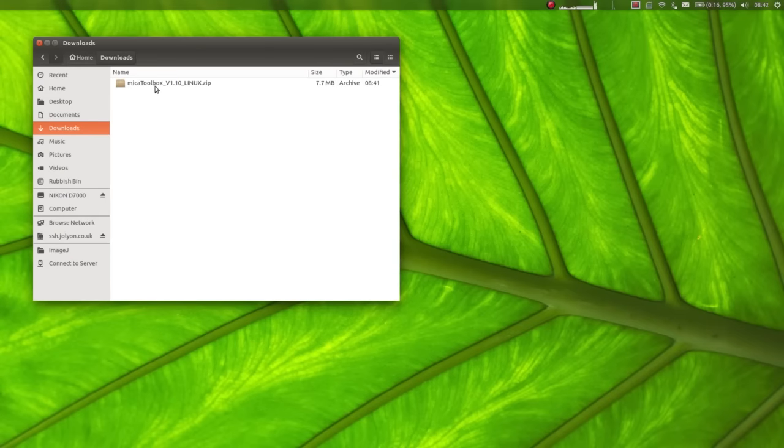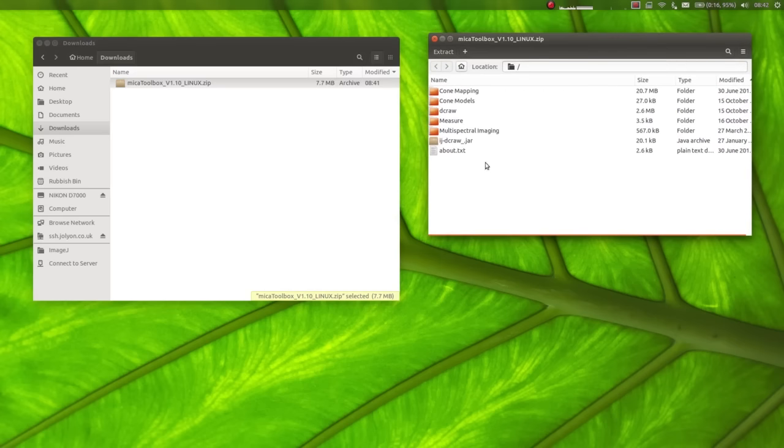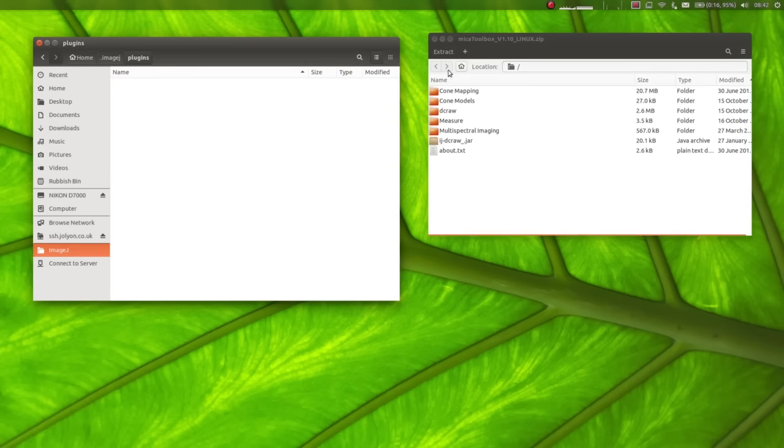Now that I've downloaded that file, you'll see it's a zip file that contains lots of other files and folders. These are all the various parts of the toolbox. Next we need to install it, and that entails extracting all of the contents of the toolbox to your ImageJ plugins directory. On Linux here, that is in home/.imageJ/plugins. On Windows, that will be in C:\Program Files\ImageJ, and on Mac, that will be in Applications/ImageJ.